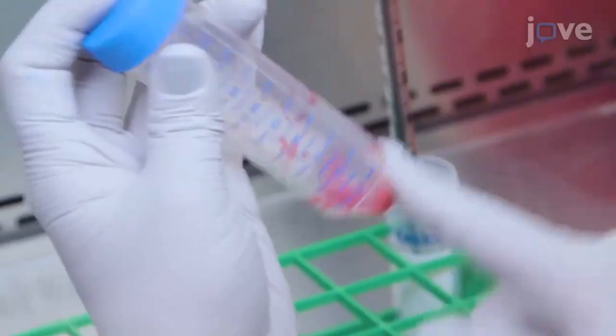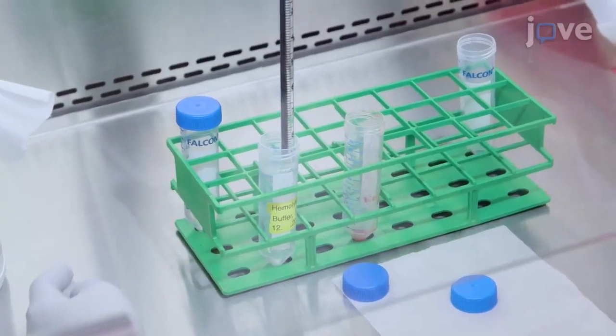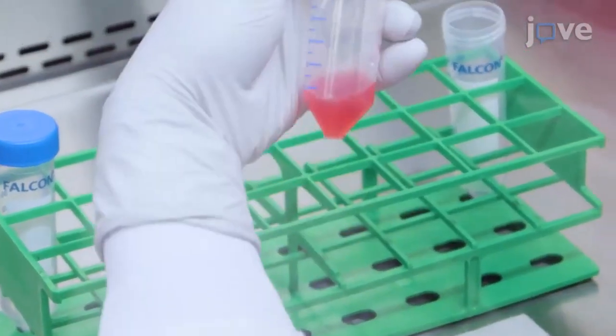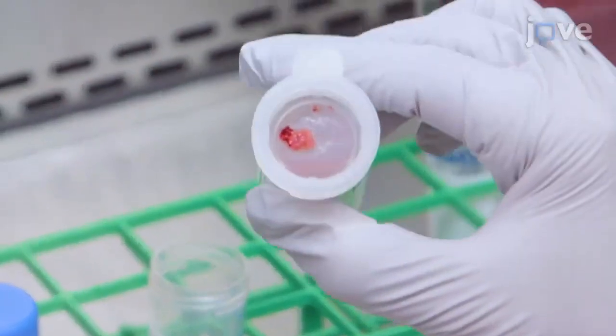Resuspend the pellet in the residual supernatant volume by flicking the tube and transfer the bone marrow suspensions into a new 50 milliliter tube using a 70 micrometer pore cell strainer to remove any blood clots.